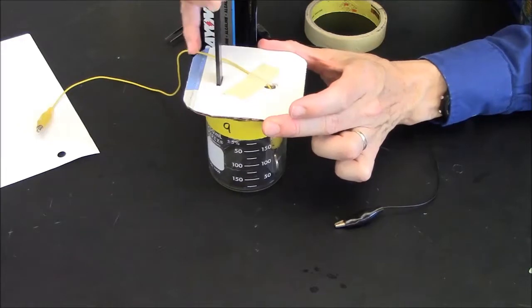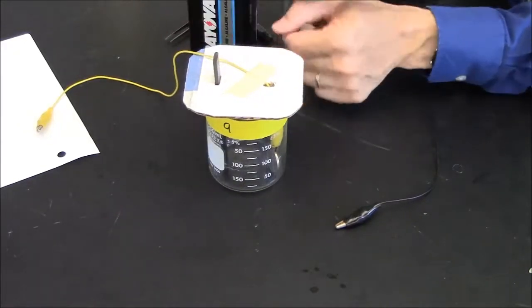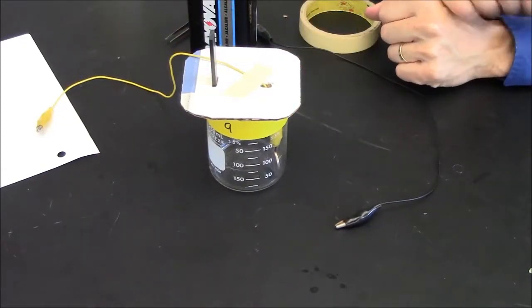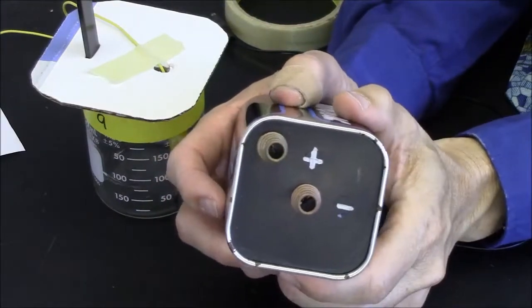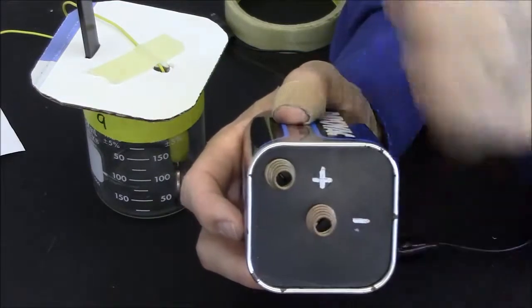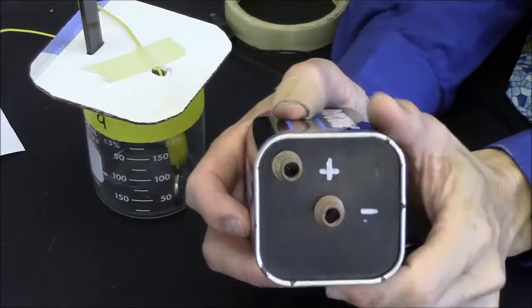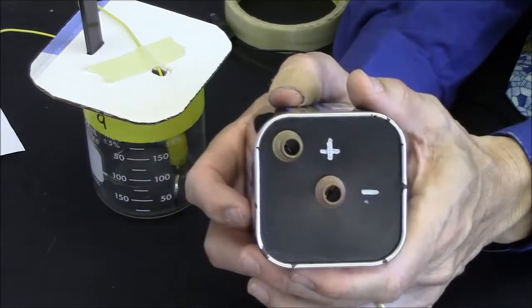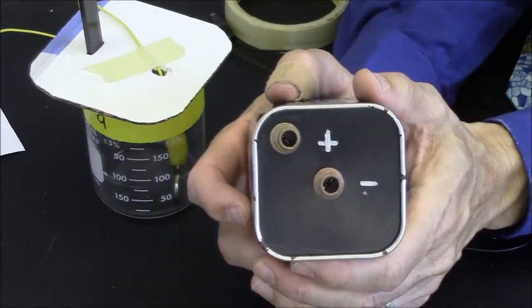The carbon fiber electrode is inserted into the slot, and I can push that all the way to the bottom or not, depending on my preference. Your 6-volt battery has the plus and minus poles, which are fairly clearly labeled, and the way you hook these up is very important to determine the chemistry in the beaker. If you hook it up incorrectly, bad things will happen. So your instructions tell you must have a diagram that you show your instructor about how you'll use this battery.